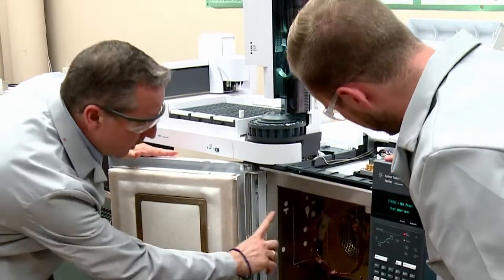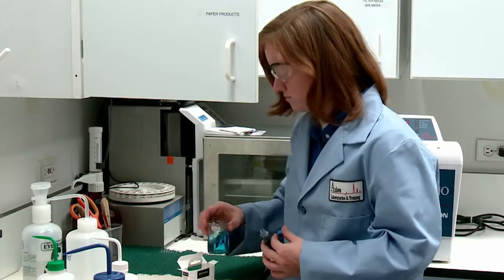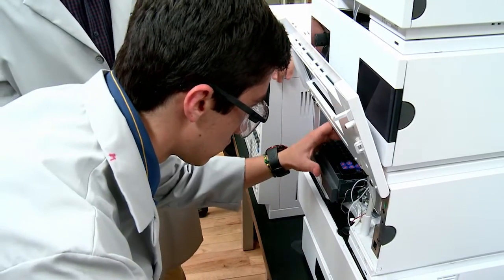Another issue we have with the GCs is that from a troubleshooting perspective, it's not always obvious what's wrong with the GC. Now, if you're an experienced chromatographer, if you've been doing this for 20 years, maybe you're pretty good at walking in the lab and seeing a tail on a peak and saying, oh, that's a dirty inlet. But again, think about the user. Think about the non-chromatographer using this great tool to measure things. Why should they have to know what tailing peaks look like? Why should they have to know how to do diagnostics? I think the GC itself can help us in terms of diagnosing problems. It should be easier to find part numbers. It should be easier to at least tell what is wrong with the instrument.